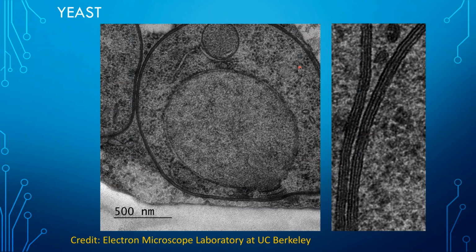And then on the other side of this is the higher resolution data. This is a screenshot I took of zooming in on this one area here. You can see from even a medium resolution image, where we're imaging at probably about 9,000x, you're still getting really nice resolution of your lipid bilayers.